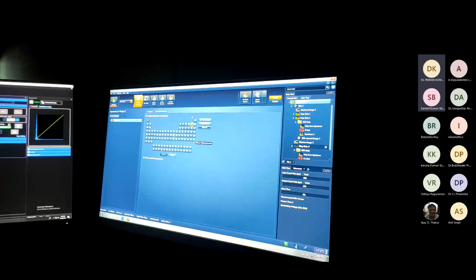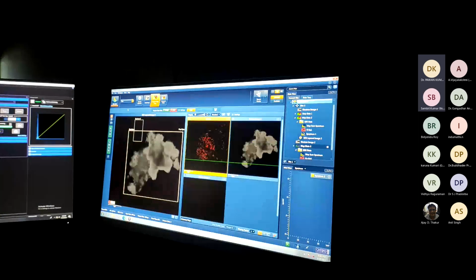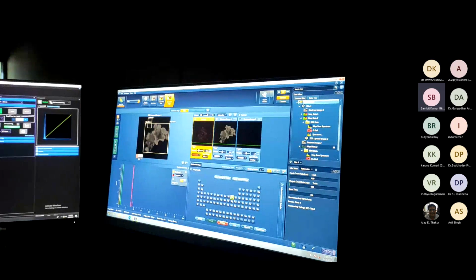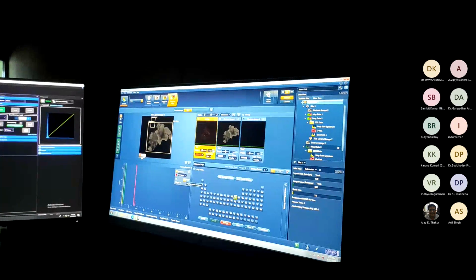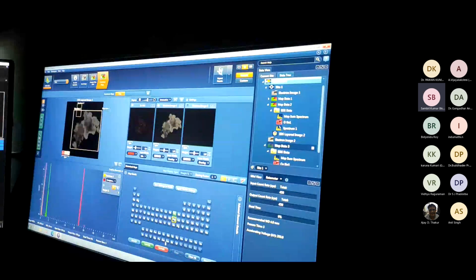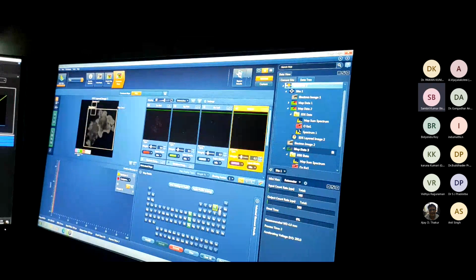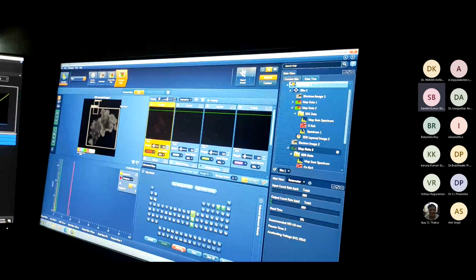Okay, so next one. Now we have to go to the map. I'm moving on to the map. Where is construct the map? Construct the map. Our interest is to include now. So I can change it to weight percentage, right? It is already on weight percentage. So I'm including the AG, AU, and oxygen, fluorine, and that's it. And copper, we are excluding the copper.